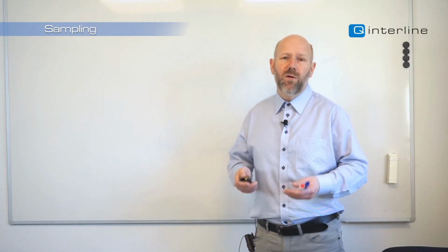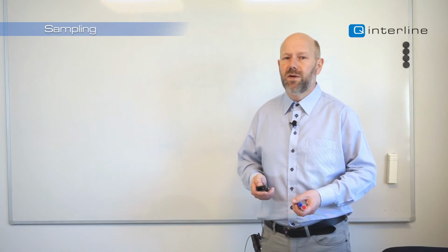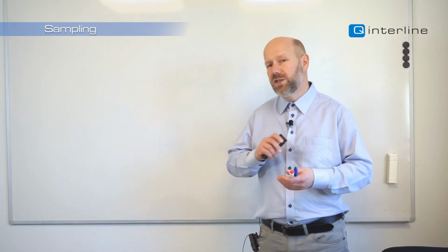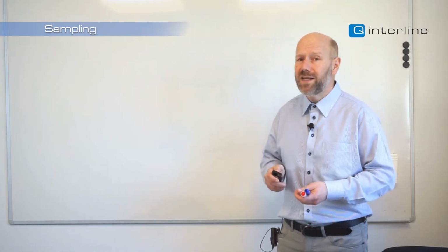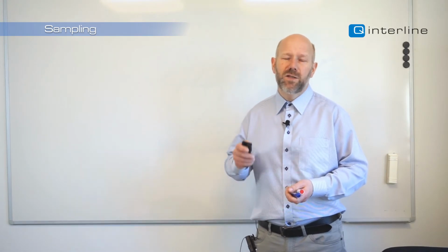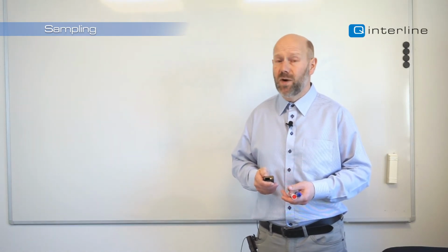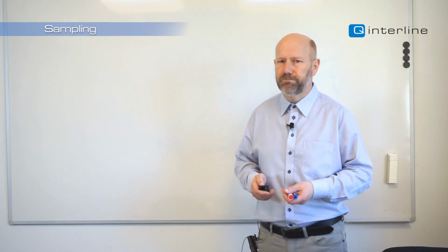When we work with NIR, which is the primary expertise of Q-Interline, we have several options. Liquids are typically considered very homogeneous, and they are likewise done in transmission, shining light through them, fairly simple. If that liquid is several phases, it becomes almost impossible to handle with NIR, especially if we have air bubbles, particles, and eventually two liquids that do not want to mix well. That becomes very, very tricky, because what do we actually see?